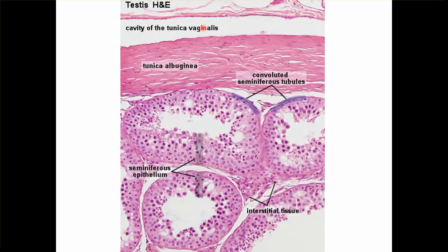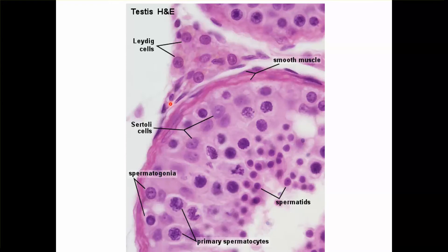You can see the cavity of the tunica vaginalis — the two layers, tunica parietalis and tunica visceral layer. This is tunica albuginea. These are convoluted seminiferous tubules. You can see the seminiferous epithelium here. In between the seminiferous tubules you can see the interstitial tissue which has cells of Leydig which secrete testosterone.